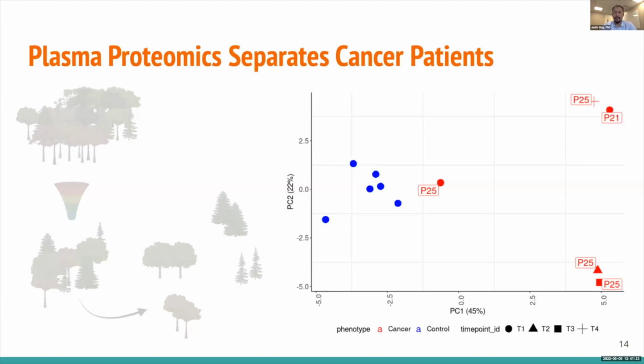However, it is still interesting to note that the latest time point of Vanessa, which is time point 4, clusters relatively close to Shirley at the very top quadrant there. And so we're currently delving further into why this might be the case and why this specific sample time point is very close in proximity to Shirley's time point, like how their proteome profiles are actually correlating or closely matching together. This analysis demonstrates how feature reduction and PCA can reveal meaningful patterns in patient proteomic data, which can aid in the identification of distinct clusters and provide insights into disease progression and patient similarities.